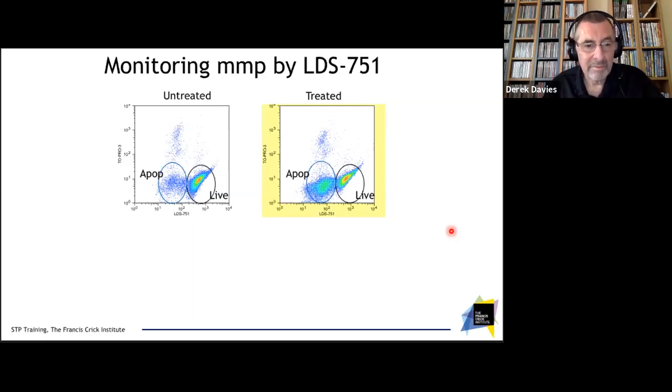You shouldn't believe me because with all experiments, we should try to check what we're saying about those cells is true. And remember, morphology is very important in apoptosis. I said I wasn't going to talk about sorting.